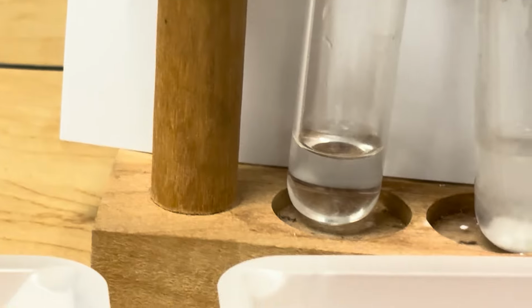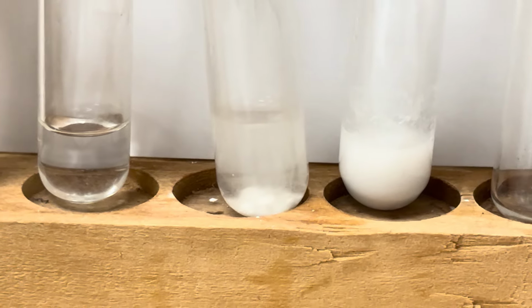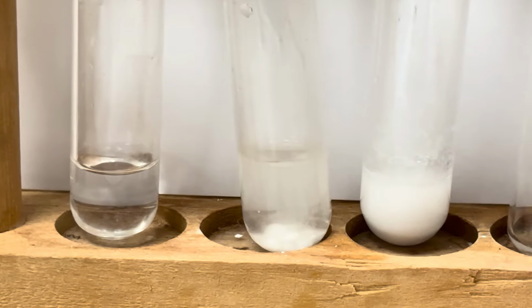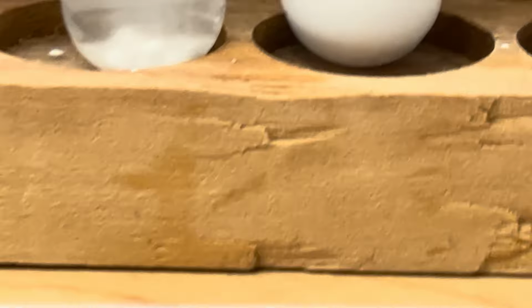Okay, so out of these three, remember that's potassium carbonate, calcium chloride, and calcium carbonate from left to right. It looks like the potassium carbonate dissolved the most. The calcium chloride seems to sort of be dissolving. We can see some bubbles. Do y'all see that?